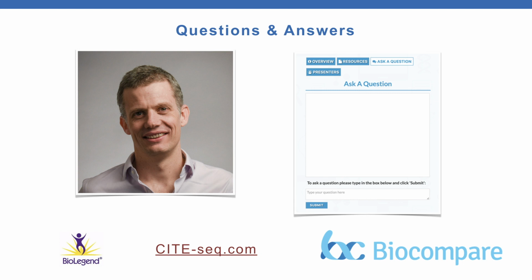We have certainly found that the reagents from BioLegend seem to work better than our own reagents. They have much more control over the site of conjugation on the antibodies, whereas we don't really have control. When we conjugate, at least the method by which we do it, it can conjugate at any point on the antibody, which can sometimes lead to an antibody failing. But we've certainly had better success with the antibodies from BioLegend. This is kind of what these guys do.